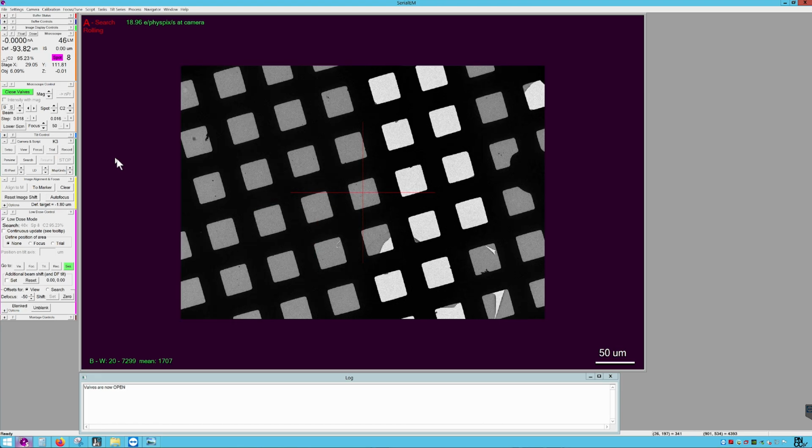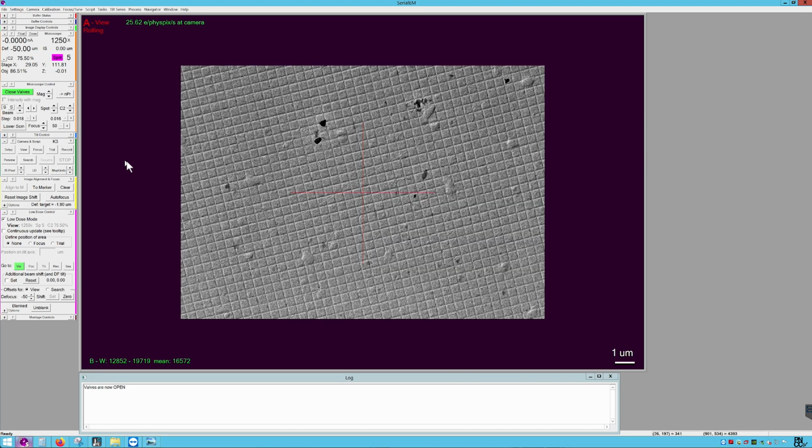Looks good. Now I can check my view imaging state. So I'll click View in Camera and Script K3. Wait for that image to appear. During the following checks, I'm looking to see that the software is returning an image and there isn't any beam edge in the field of view of the camera. View looks good. Next, I will check focus.